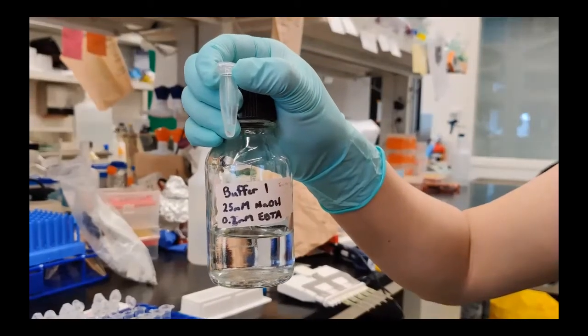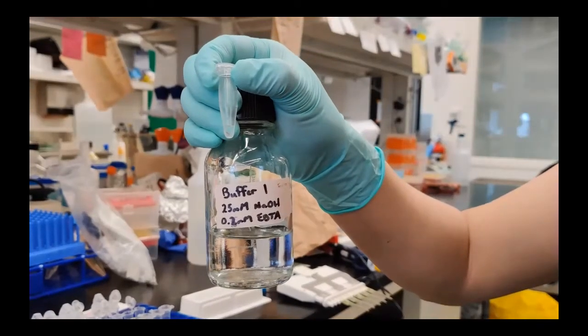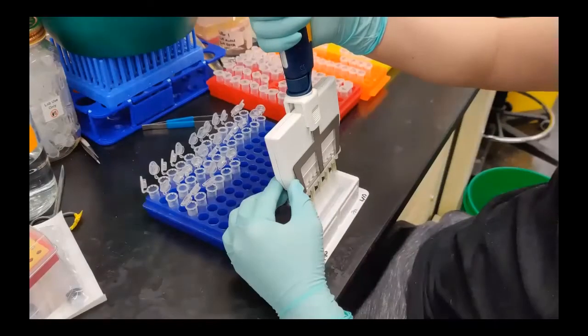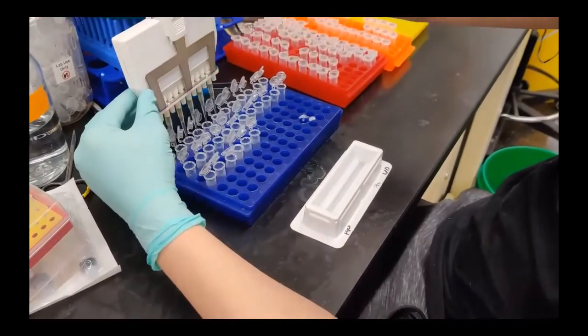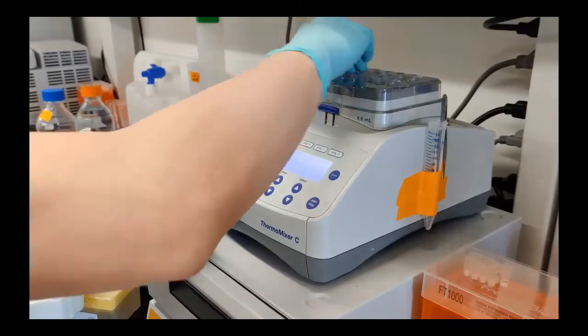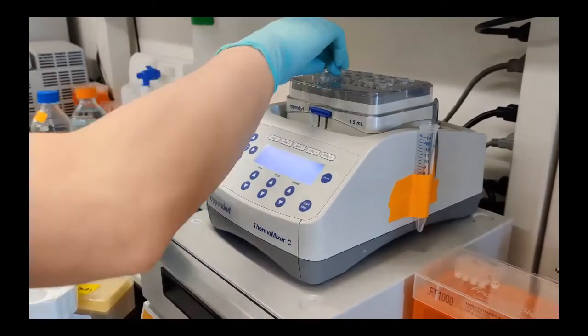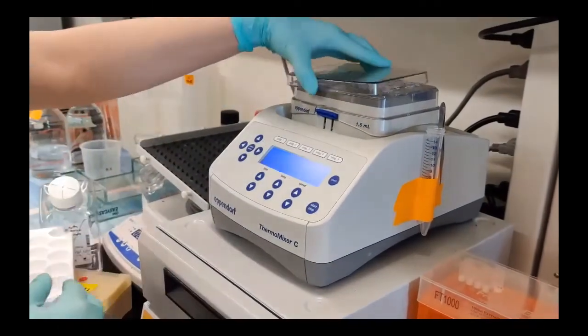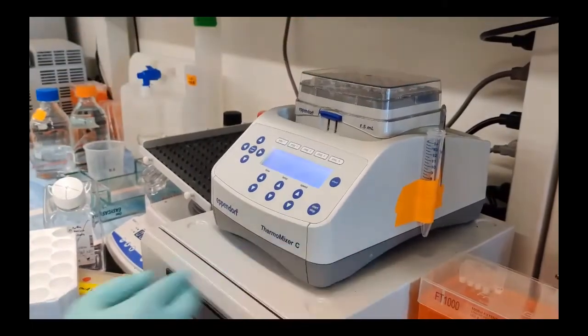First, we add a liquid that has chemicals, which helps break down the cells to release the DNA. We have to add this to all of our samples. Next, we heat up the samples to 95 degrees to help break up the cells and release the DNA.